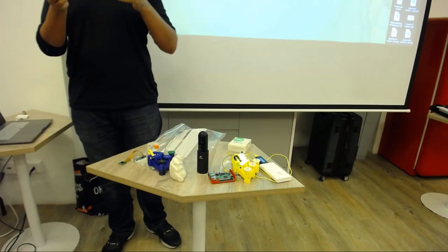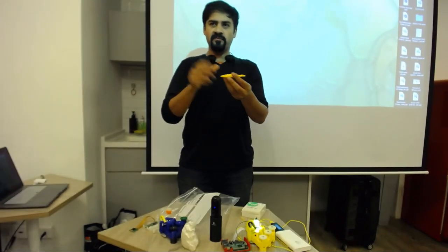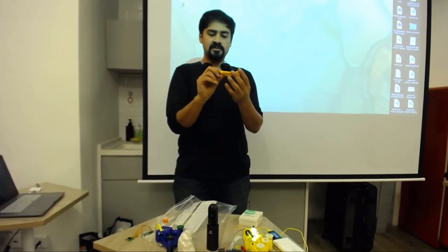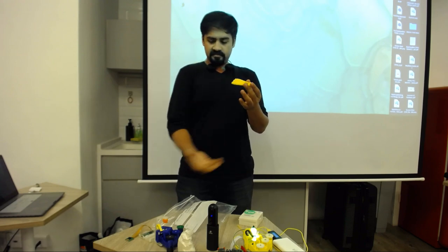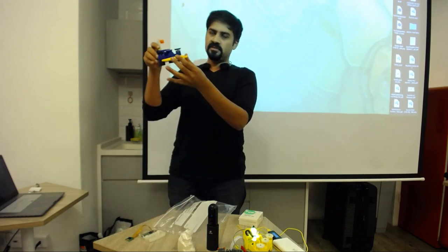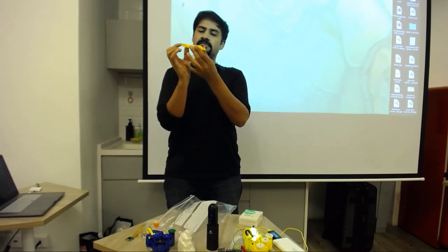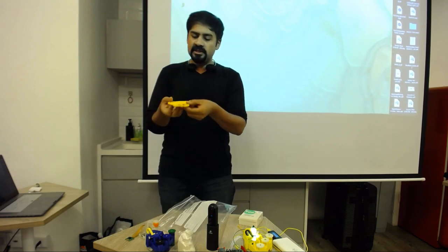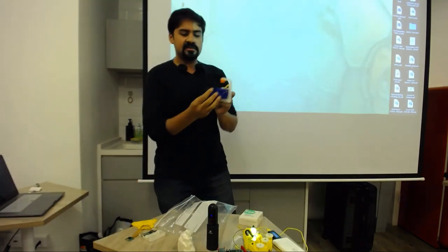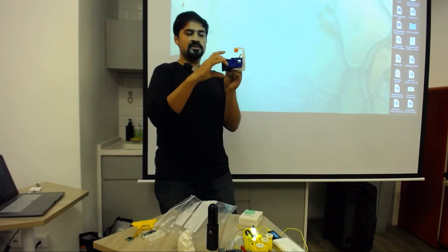So the clever bit is in the design of the Open Flexure microscope. So this is a failed print. Thanks to Hassan, is he here? No. At the bottom of this microscope, this is like the bottom slice. It's designed to use the flexibility of the PLA. So these are flexible. You've got three legs that are flexible, and each one of these is connected to one of these screws. And so when you press the screws, the table where you put your specimen actually moves.